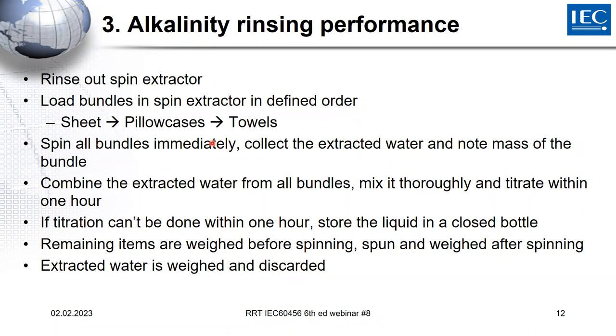You collect the extracted water, and afterwards you should take a note of the mass of the bundle. Why? Because then you can see if this is in the specification of the spin performance of the extractor. If you have spun all the defined bundles, you combine the extracted water from the bundles, mix it, and within 1 hour you should titrate it.